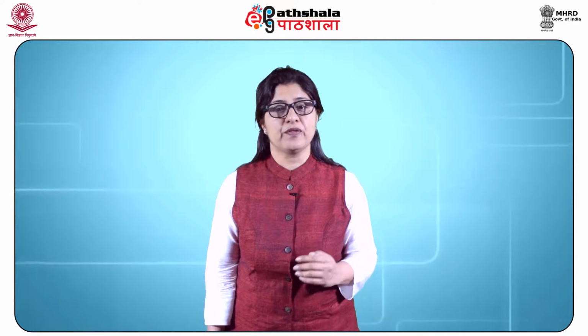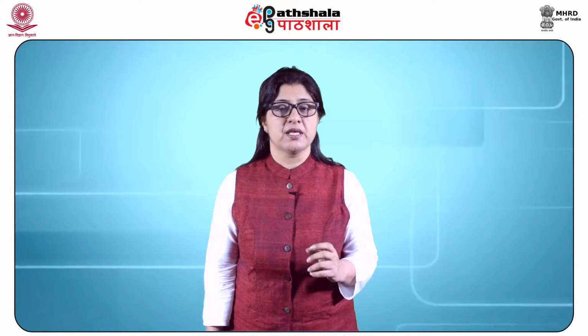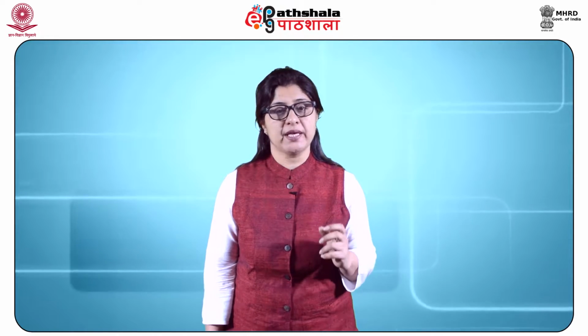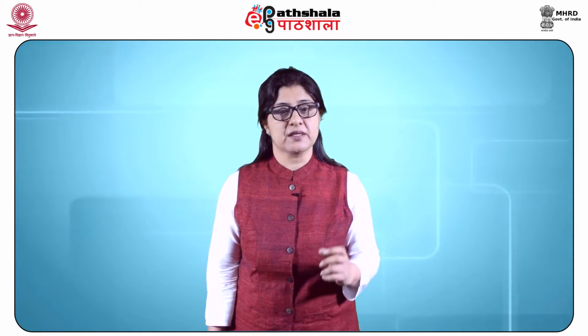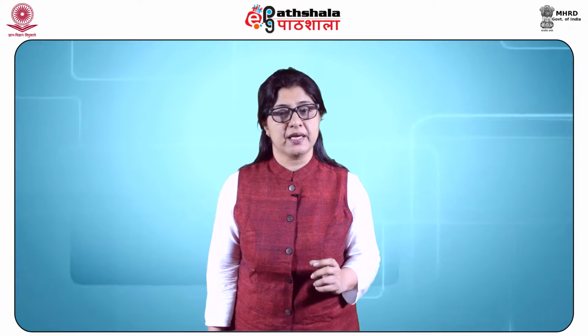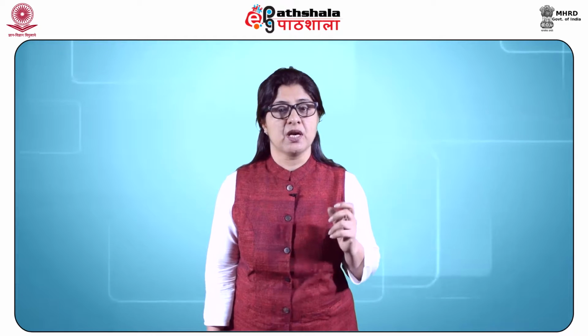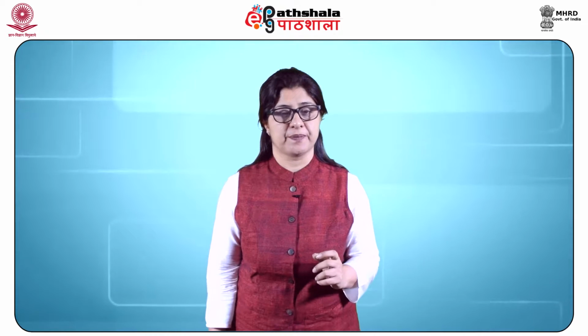However, value of extinction coefficient ε depends upon the measurement conditions such as wavelength, solvent, temperature, and also on the characteristics of the instrument used. Because of these reasons, value of the extinction coefficient ε is not used for the quantitative analysis. Quantitative analysis is often done by using calibration curve for the substance to be analyzed, which is constructed by using one or more standard solutions with the known concentration of the analyte.